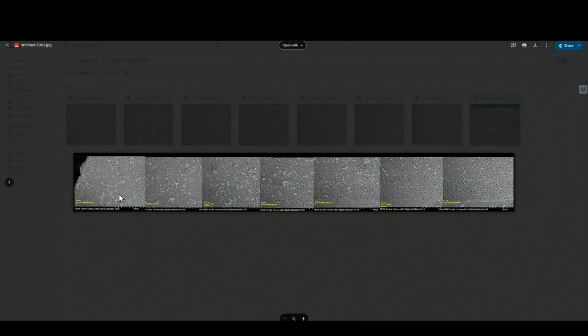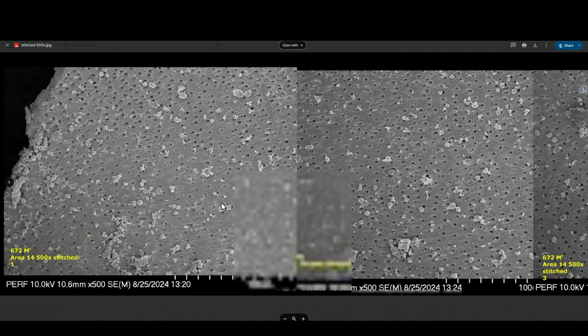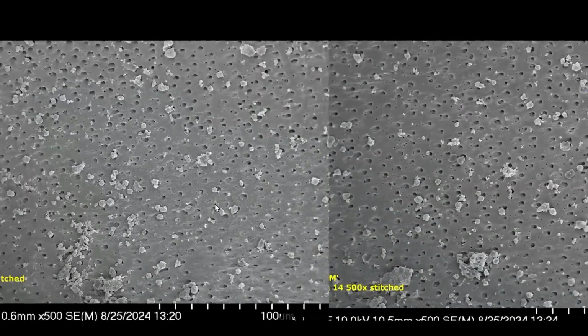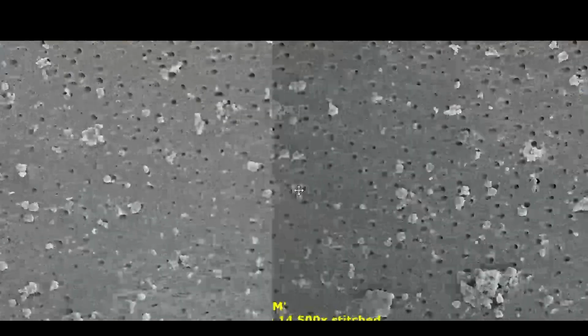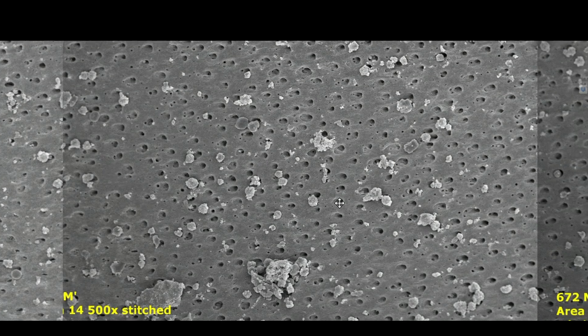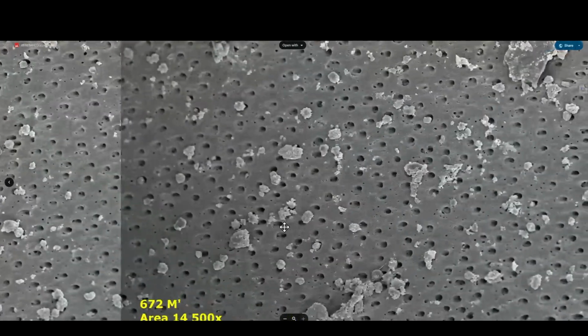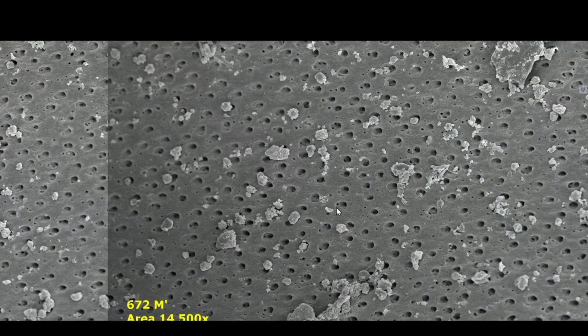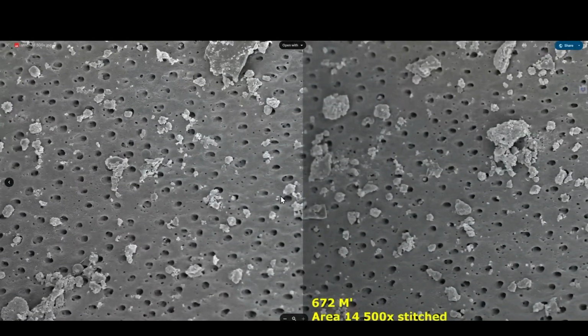This was quite an extensive stitch at 500x. We can go in a little tighter. And it looks to me like all of the peritubular dentin has been pretty much demineralized. So the device apparently does a very good job of demineralizing the peritubular dentin.